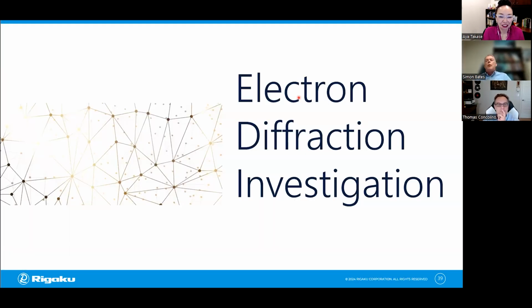So we wanted to look at what was going on in terms of the lithium layer. What on earth was happening? How can we get higher occupation of lithium? And we have a new toy, an electron diffraction system, a Synergy ED, and that allows us to look at nanometer-sized particles and get crystal structures. Well, assuming they're crystalline, of course. So what we can do is take the cathode material and scrape a little bit off the aluminum collector, and then we can scan through the grains of the cathode material and get crystal structures.